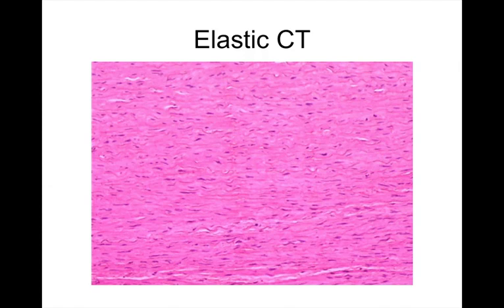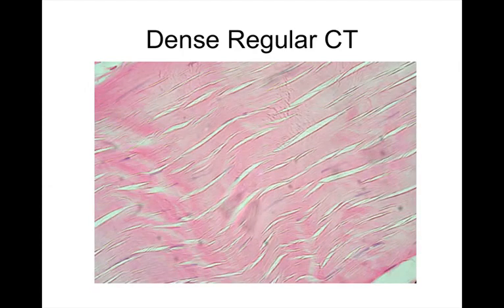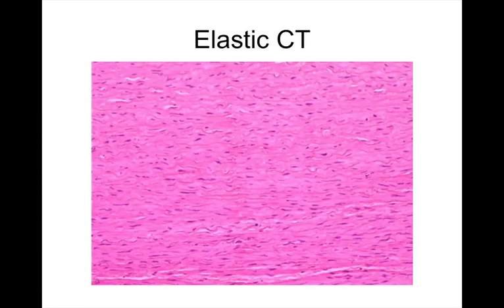I agree with that, but we never call that regular elastic connective tissue, and I suppose we could. I don't know if it's because dense regular connective tissue is linear, whereas most elastic connective tissue lives around the aorta, like big blood vessels that are pulsatile. We're looking at the bottom part of a section, like the wall of a tube. So here it looks like they're going straight left to right, but in real life they're actually going circumferentially around. So that might be why they don't do it. But that's a weird one.